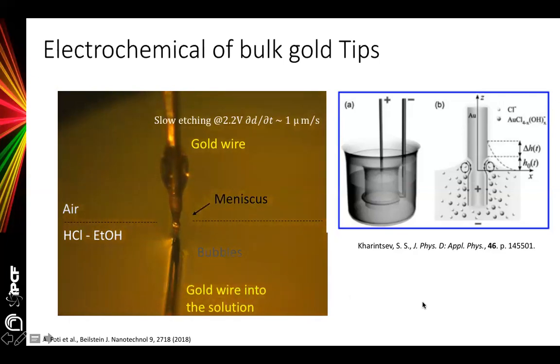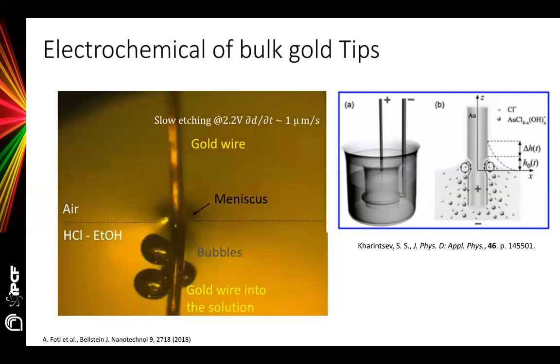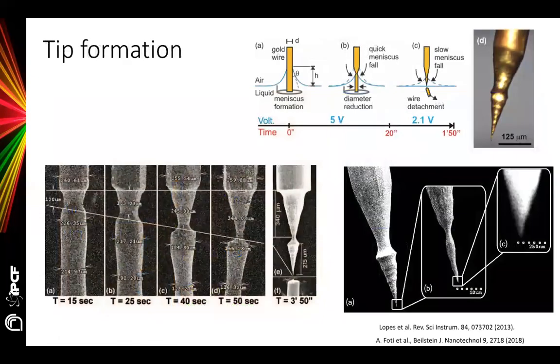Okay, now it should drop. Now it is very thin, and the piece inside the solution is too thick, and it will drop. Now the process self-terminates.